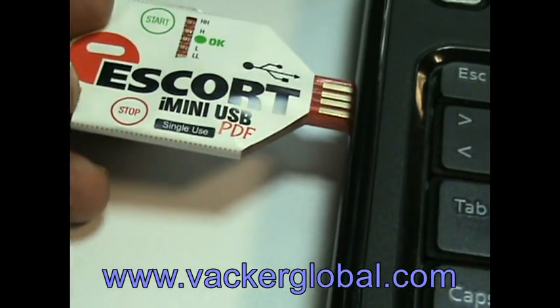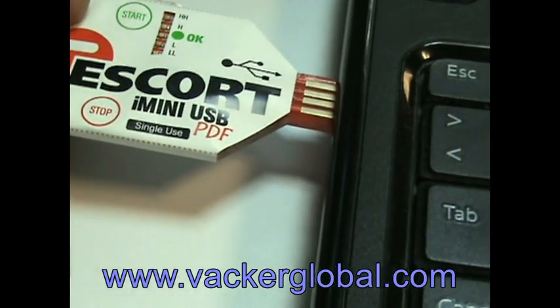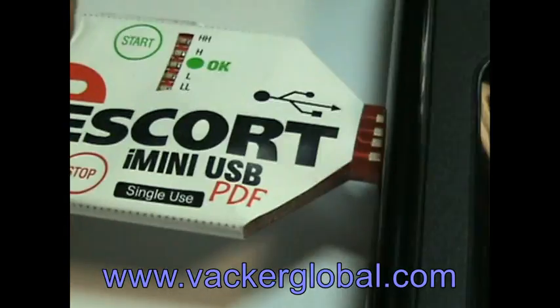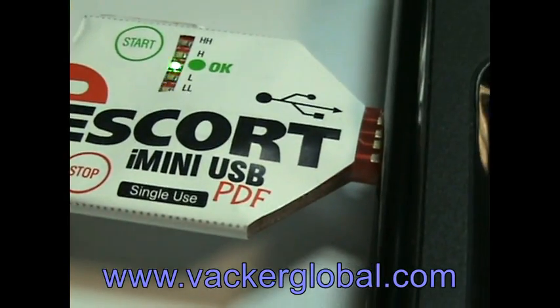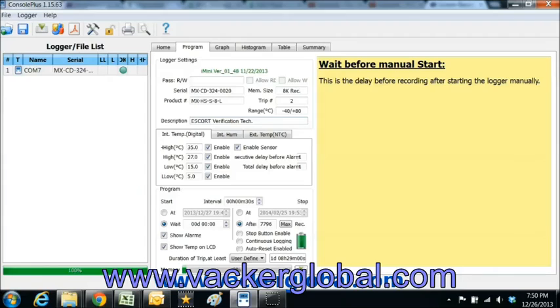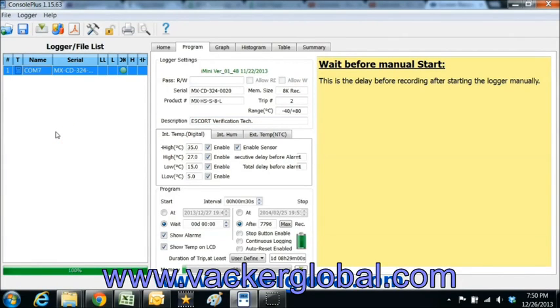Insert the data logger into USB port of your computer. Once the device is connected to the USB, the device automatically appears on the screen.